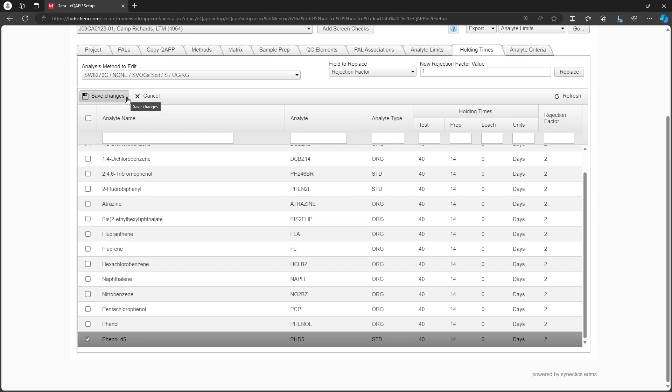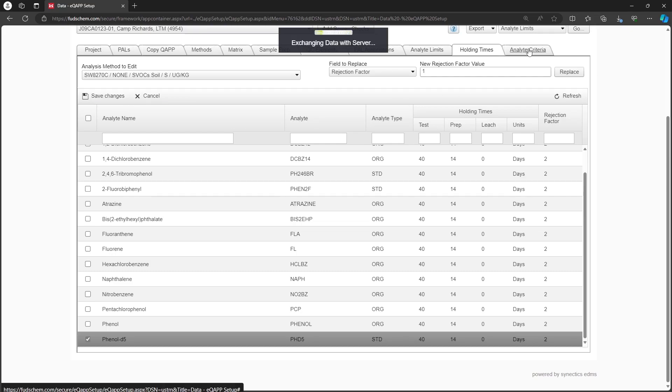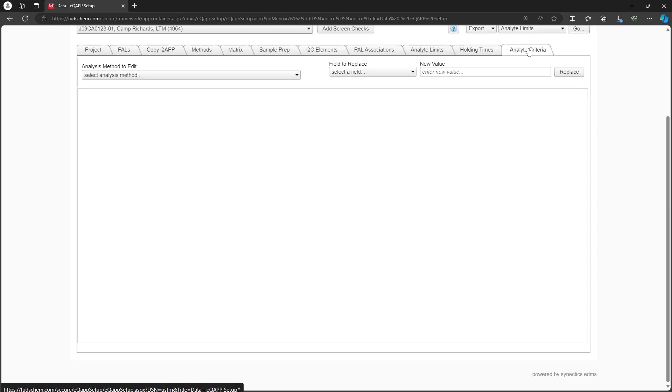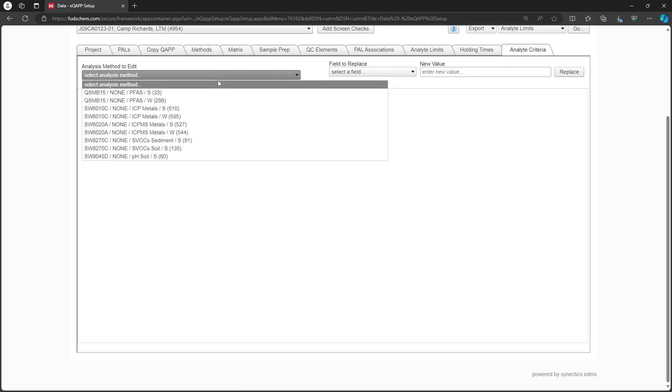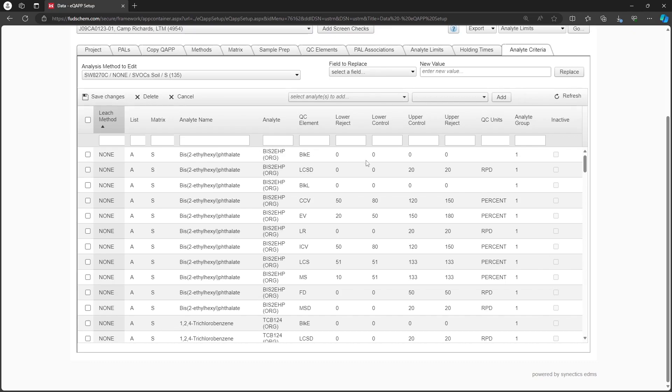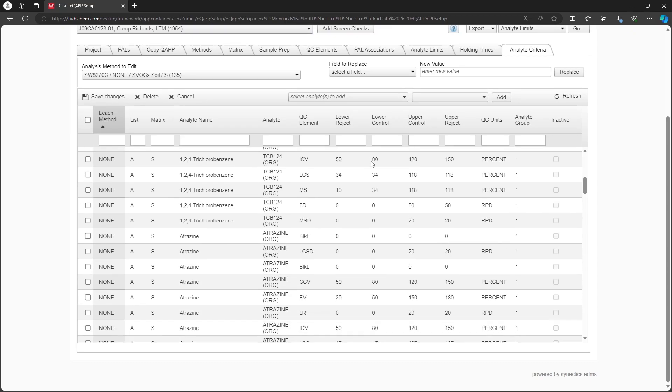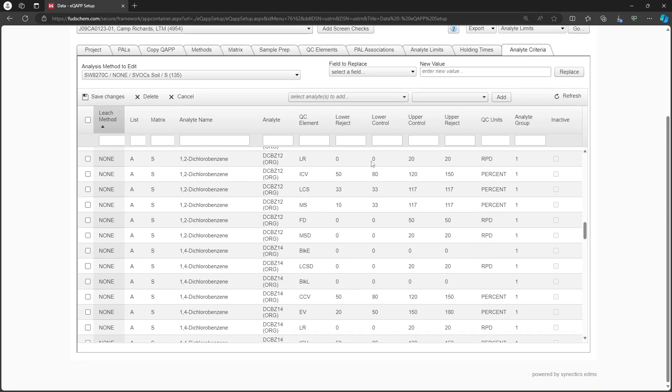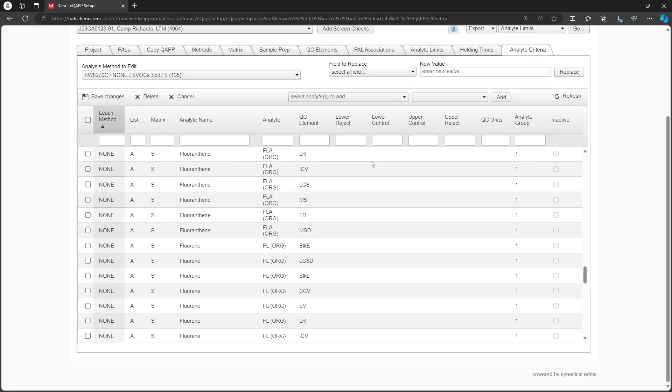Let's go to the Analyte Criteria tab. Select the method. We can see that the new Analytes have associated QC elements, but we will need to fill out the limits. We recommend using the export to update them in Excel to save time.